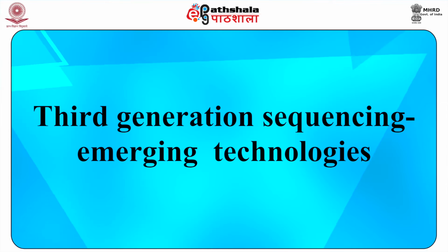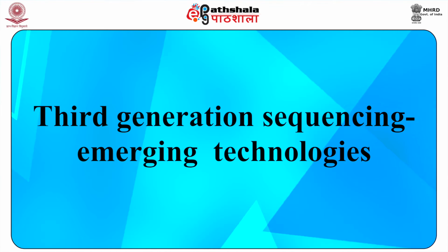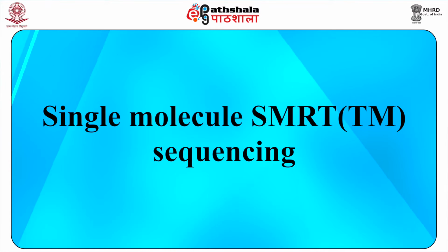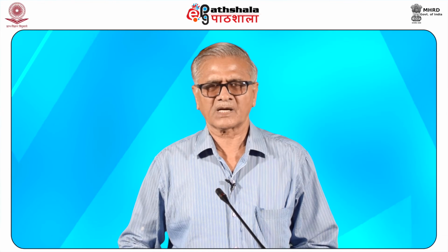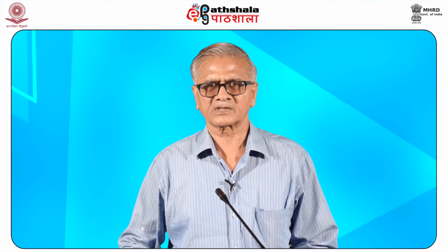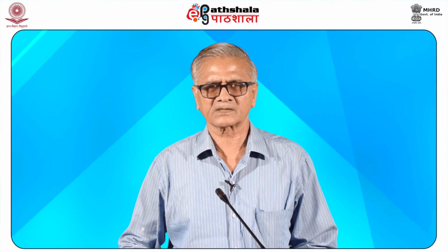Now we come to third generation sequencing, or emerging technologies for sequencing of DNA. In this, the first method is single molecule sequencing. In short, it is called SMRT. SMRT, or single molecule sequencing, is based on the sequencing by synthesis approach.